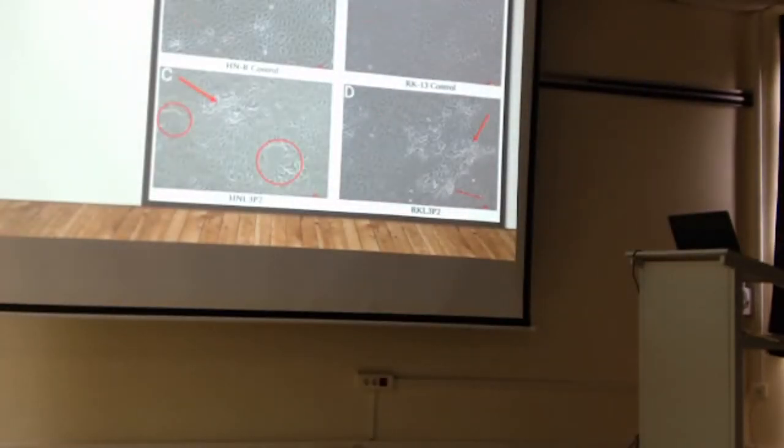Here, you see one of the initial passages that were done. On top, you see the control cell lines, which were not infected, and then the infected cell lines with the same hare myxoma virus. Throughout this presentation, you will see a code like this, where the first two letters represent the cell line that was grown, then the virus represented by L3, and then the passage number will continue to change as the experiment progresses. Pointed with arrows, we see classical myxoma formations on the cell lines. In circles, we also see areas where the monolayer lifted either due to infection itself or the health of the cells, but we also see some myxomas.